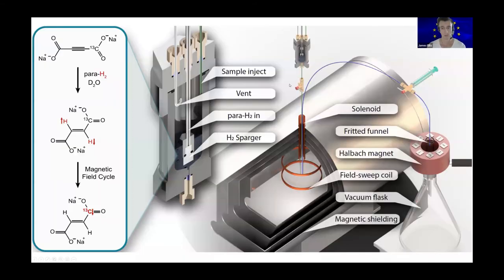Okay, so here is now again a picture of the whole experiment where I include this precipitation stage. So here's our chemical reaction, here's our reactor. We're gonna do the reaction, we're gonna shoot the sample down with the shield, polarize the carbon 13 spins, and then what we can do is take some of that solution and add it to hydrochloric acid waiting on a glass sinter in a magnetic field, and the fumarate should precipitate out as a pure solid. And we can filter off the unwanted reaction side products, catalyst molecules, and unreacted starting material.